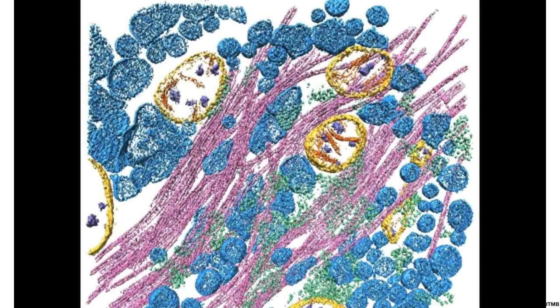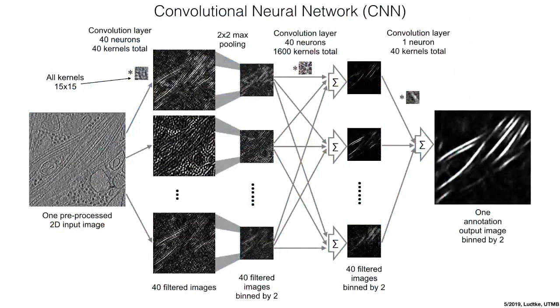A couple of years ago, we published another paper in Nature Methods where we developed a convolutional neural network approach to solving this problem. Now, I'm not going to spend a lot of time talking about this today. I'm not going to go into the details of convolutional neural networks. That's a longer talk.